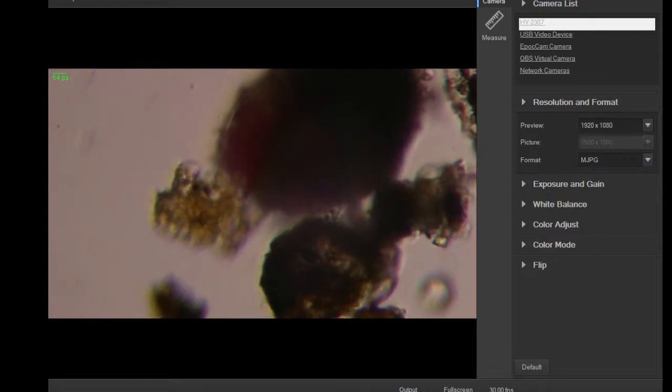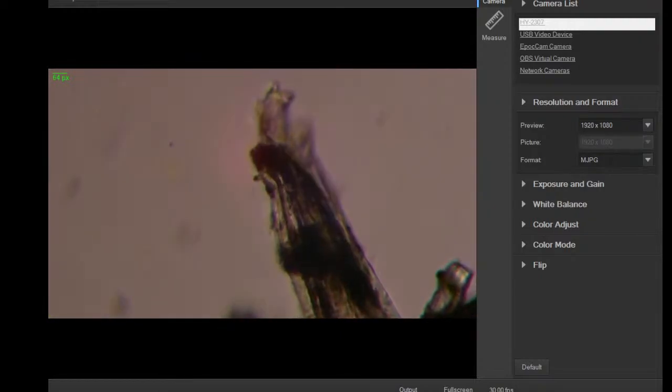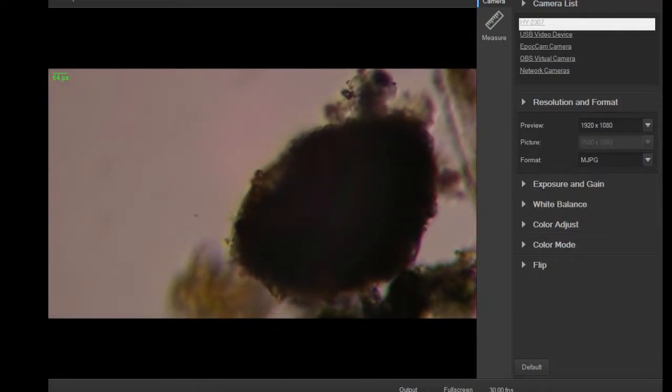It's on the other side of this chunk of debris. See, it's kind of peeking through there a little bit. Oh, there we go. Nice little guy. And you can see structure inside of it, little spheres. Those are most likely food vacuoles. It's already had some yum-yums that it had ingested earlier. And it's digesting, basically like little micro stomachs.